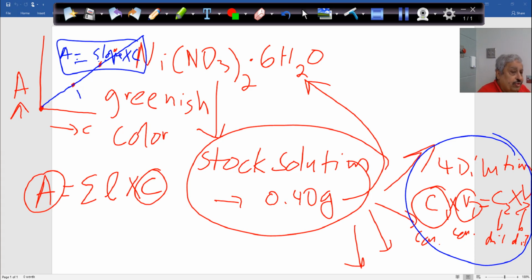We have 4 known concentrations, and the 5th here, the 0. 5 points we have in the graph, all well-known concentrations. We measured their corresponding absorbance, correct? We did this one here, and we call this our calibration curve. This is very important. That's the Beer-Lambert law. Calibration curve.